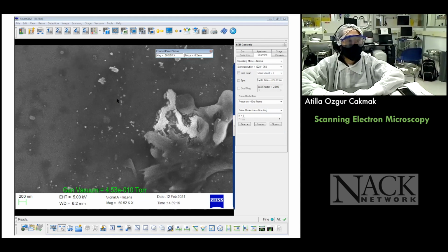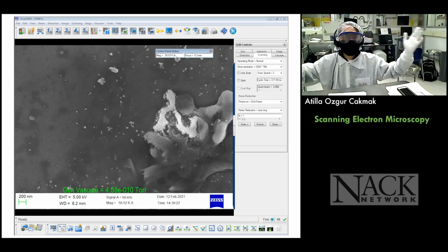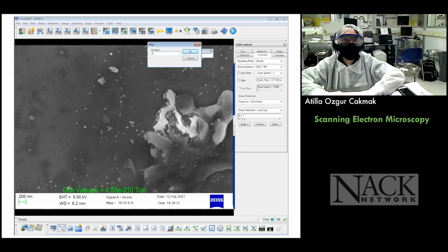So, Narendra, can you go there and write down like 200,000? 200,000 is an impossible task for an optical microscope. Now, these gold nanoparticles are like half the size, or let's say 1/3 of a coronavirus. So we're at that magnification, or at that zoom level.